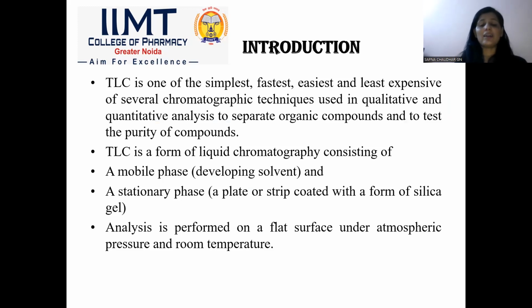Introduction. Actually, TLC is the simplest technique and a very cost effective method. Various chromatographic techniques are used for the qualitative and quantitative analysis and separation of organic compounds and to check the purity of compounds. So this is a very famous method of separation of components, in which a mobile phase, simply called the developing solvent, like methyl acetate or methanol, is used for the separation of components.